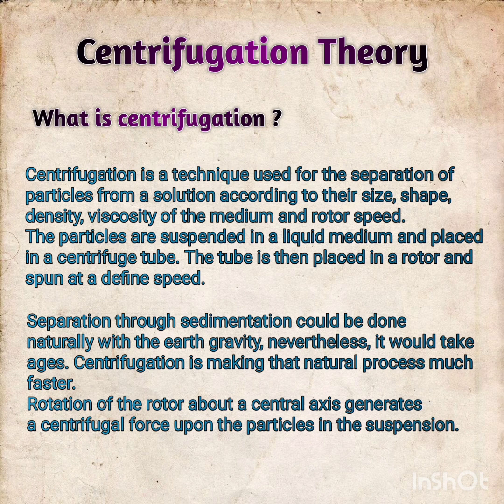Rotation of the rotor about a central axis generates a centrifugal force on the particles in the suspension. So as the particles are placed in a centrifuge tube and the tube is placed in a rotor and spun at a definite speed, the rotation of that rotor creates a centrifugal force upon the particles in the suspension, and then the centrifugation process starts.